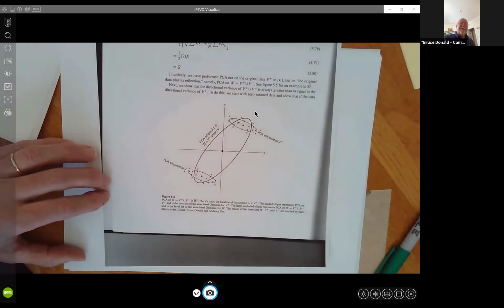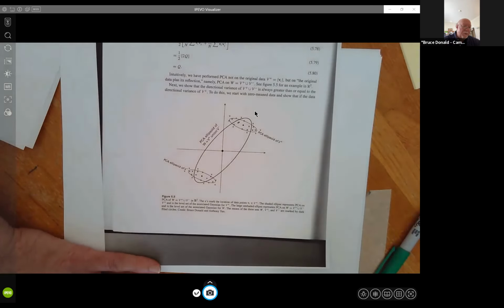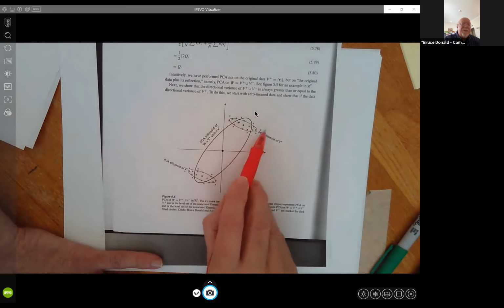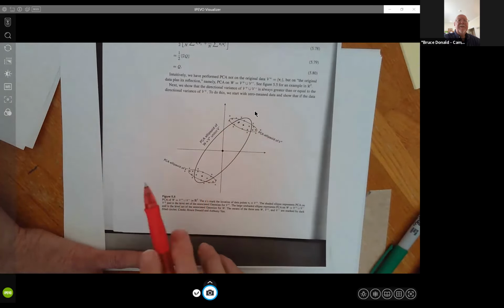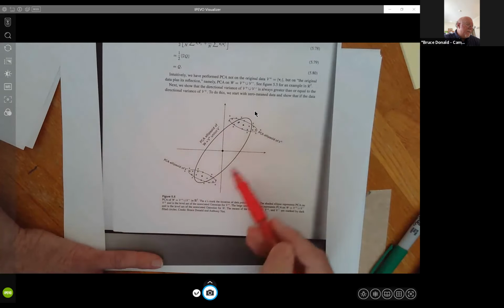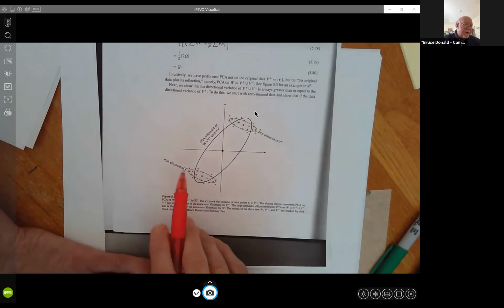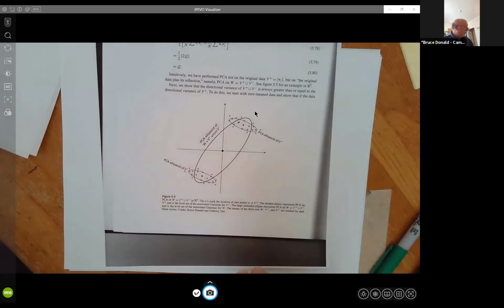So what it means for our actual fit is that our real situation is something like this, which of course is appropriate to cover in a textbook, but in a lecture like this is a little complicated. We do have a cloud of points and we take PCA. However, we actually have two clouds, up solutions and down solutions. And so our PCA is a very broad approximation. It's an ellipsoid that fits both of these. Again, you can read the textbook for more details on that. But nevertheless, this works quite well empirically, and it's a good approximation.